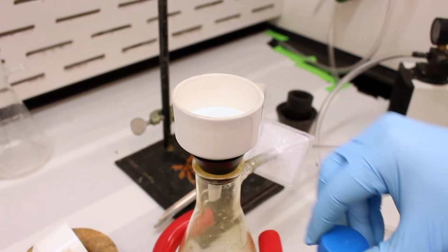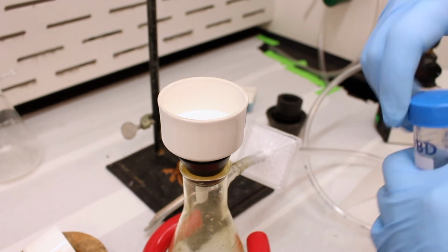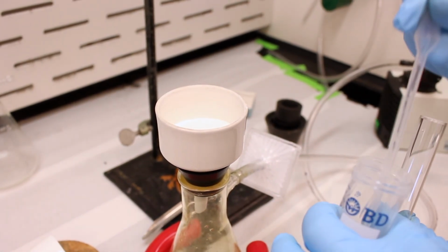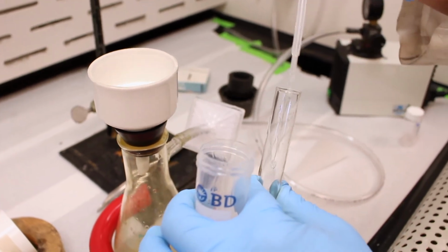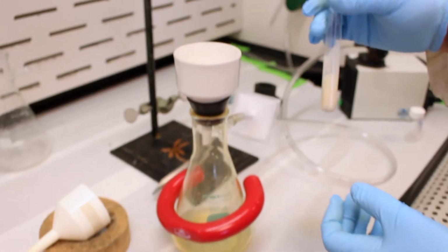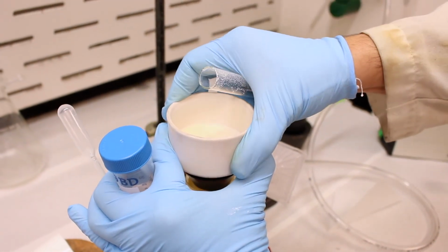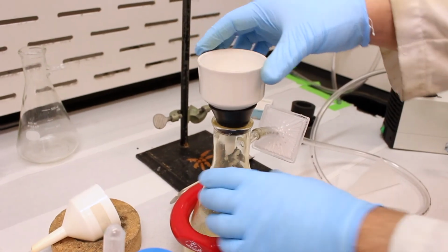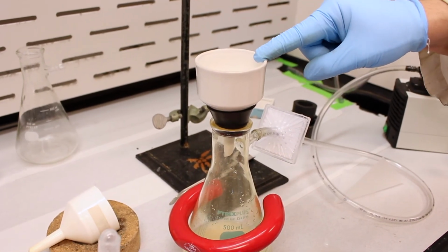Let me add a little bit of ethanol to it to help break it up. So this is cold ethanol. There we go. Okay, and now we can turn on the filter and filter it away. Okay, you can see it's a fairly white crystal here.